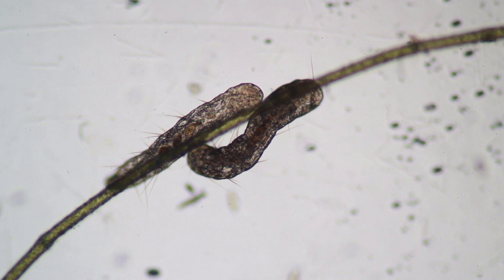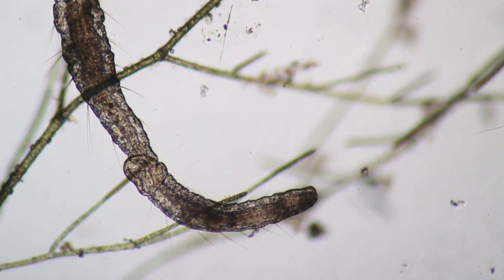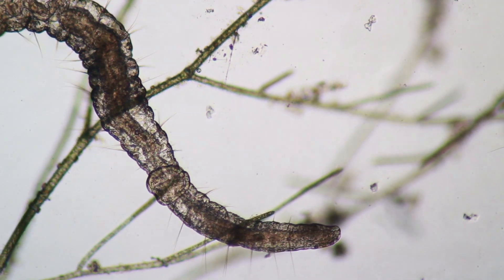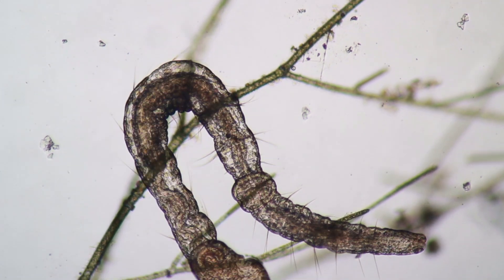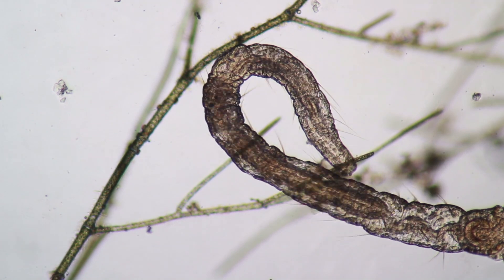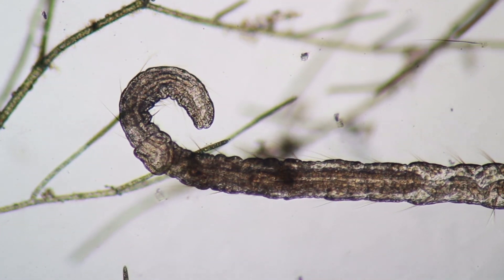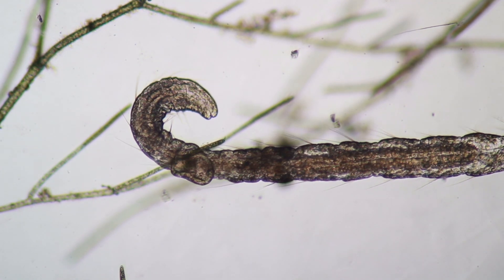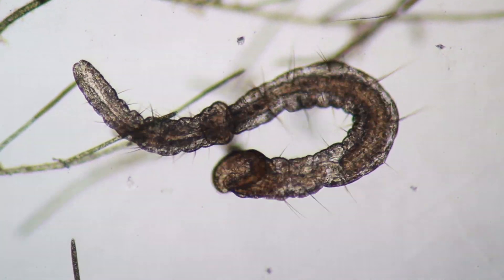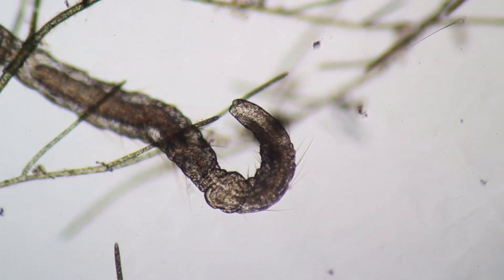Two headless stumps here. That's an interesting one — look toward the end of the tail: there's a bulge in the lower third, and that is a new head developing right in the middle of a grown worm. After some time it started to separate and split off, and this is where a second worm formed. So that's a form of asexual reproduction — that's the bulge you see in the lower third of the worm.